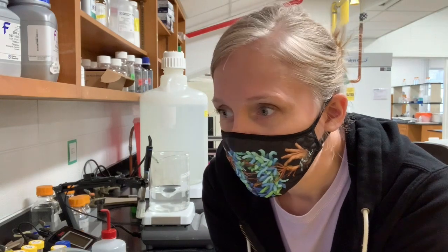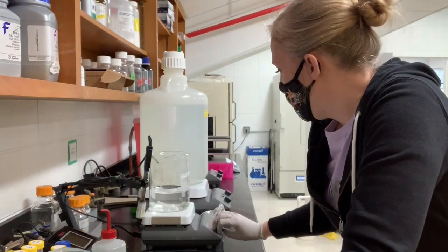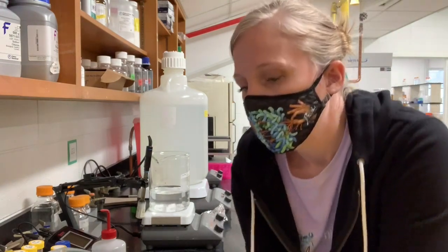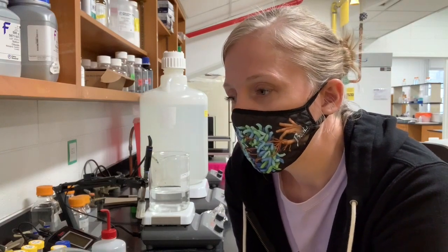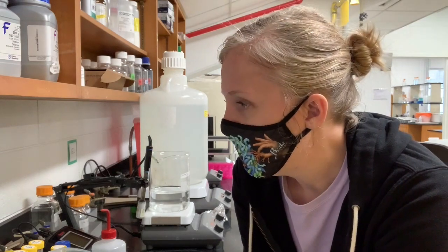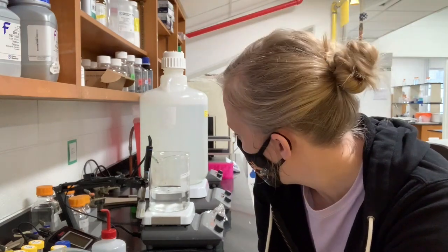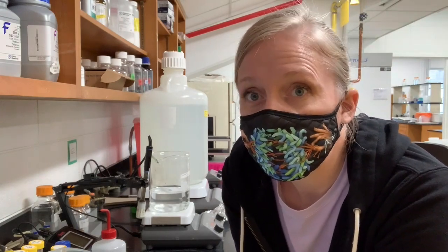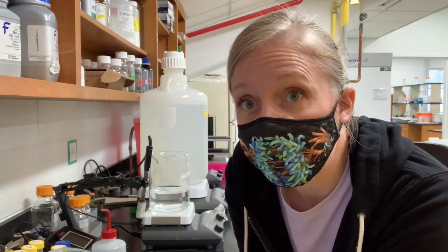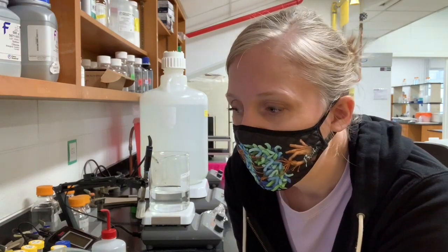a very saturated solution. And sometimes people will be making a salt solution and it just won't go into solution, and if it does that, you've set it too high. If you find that the salt hasn't dissolved after 20 or 30 minutes, you can add a little bit of water. So for example, I mentioned that we're well under 1 liter here. For a saturated salt solution where you're not going to pH or anything afterward, you may have to get closer to the final volume for all of the salt to dissolve.